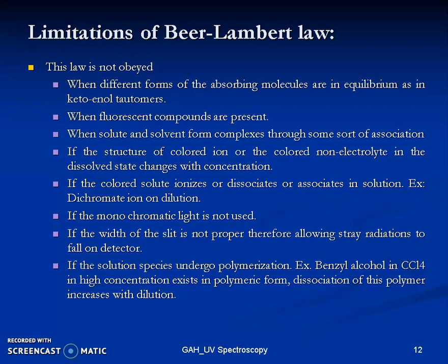And the second case when it is not obeyed is when fluorescent compounds are present. What happens with fluorescent compounds is that they will have a different electronic excitation and relaxation process. When the electron is excited, it may not shift directly to the ground state but rather go through some other state and then come back to the ground state, and that is also accounted for during the absorption process. So fluorescent compounds will not obey Beer-Lambert's law because of the different electronic excitation and relaxation processes.